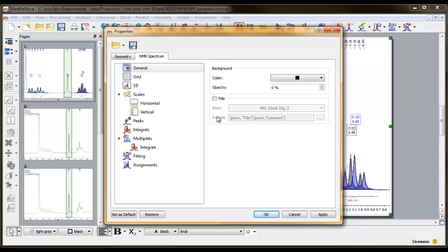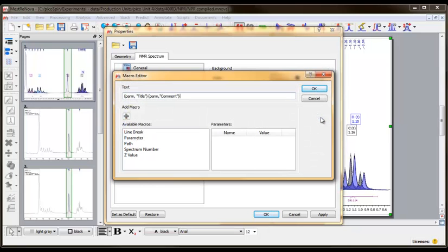If this section is grayed out, click the checkbox next to the heading Title. Now, click the Options button at the end of the Format box to access the macro editor.